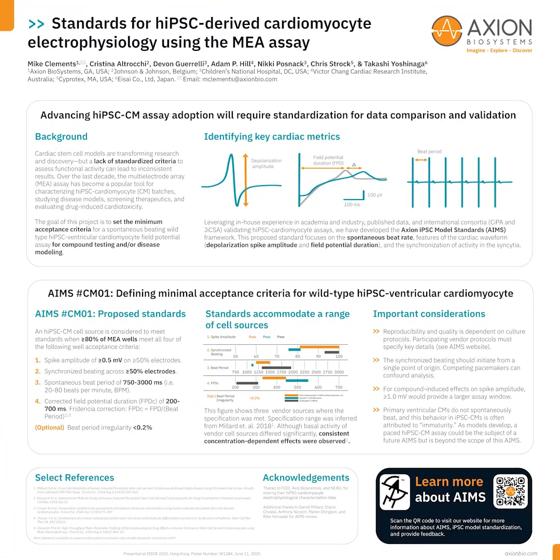In summary, here we've established a functional standard for iPSC-cardiomyocyte electrophysiology using the MEA assay, our goal being that this new standard will help advance the adoption of iPSC-cardiomyocyte assays by aiding data comparison and validation.